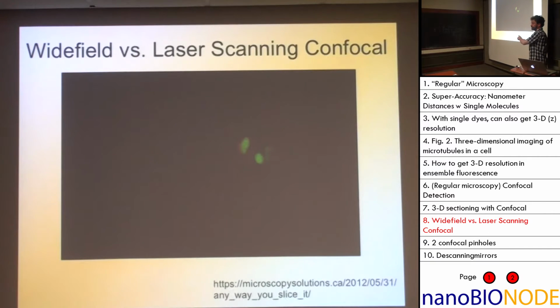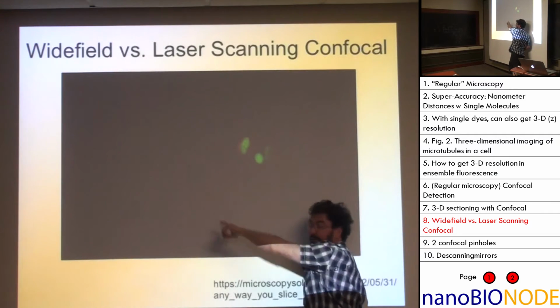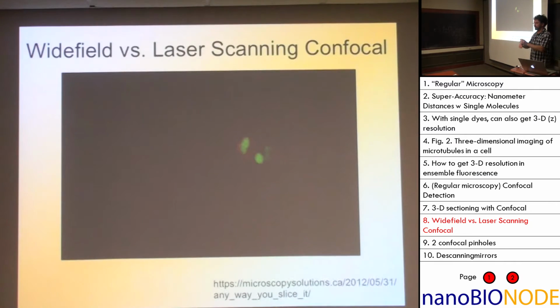The one there is just the wide field. So you basically come in with your microscope. You're not trying to bring the laser down to a small point. It's wide field, and you end up collecting basically all of the light, including in your so-called field of view, but also at different z-axes.